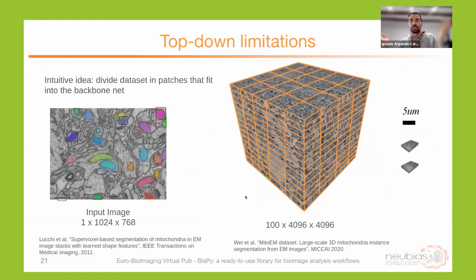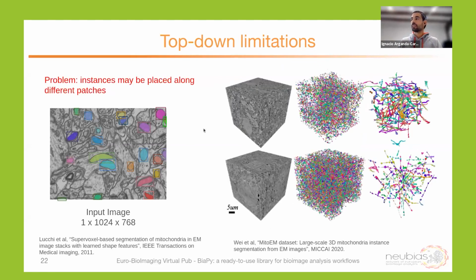Well, Ignacio, this is a typical thing too. We do divide and conquer. We create patches out of the entire thing of a specific size, hopefully of the same size as the input to the backbone network, and then solve the whole thing.